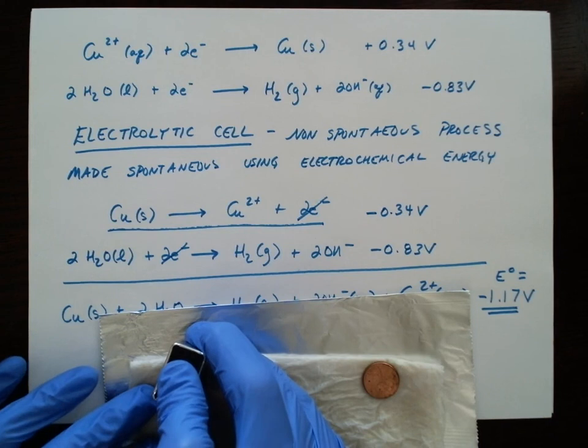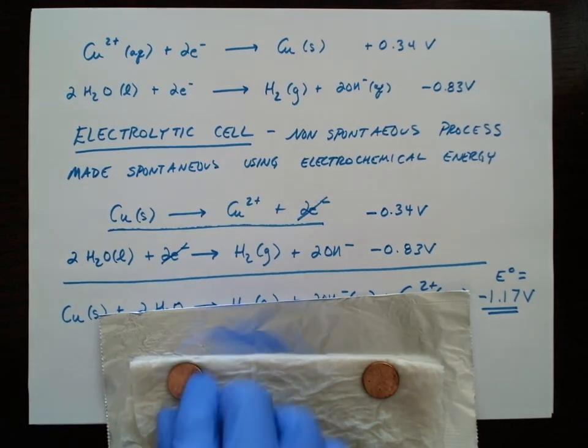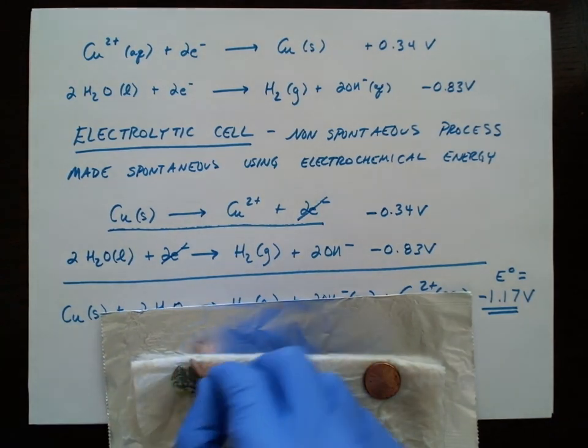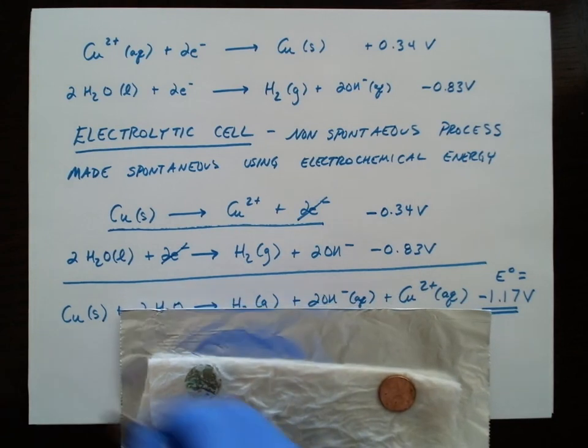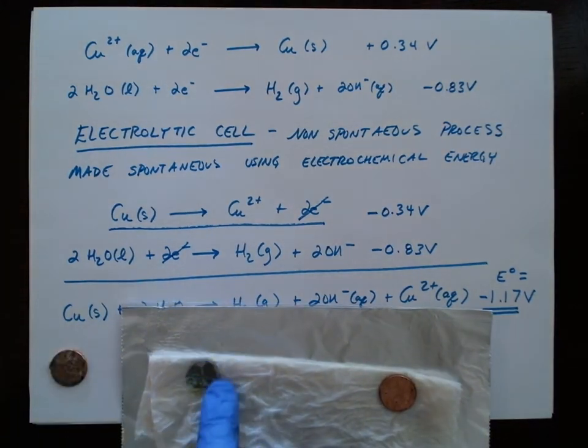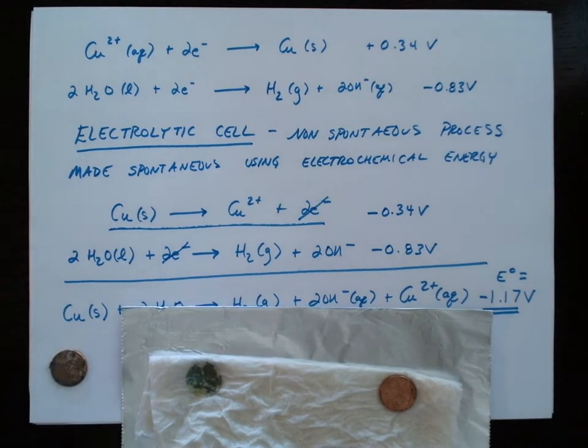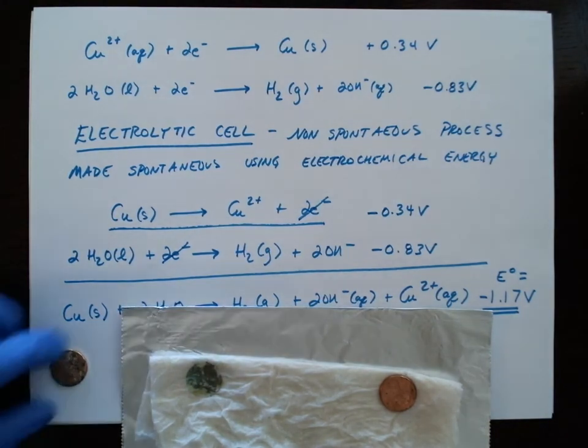Hope you can hear that. Let's see. Oh yeah, look at that. We definitely generated some copper 2 ions, sort of that blue-colored stuff that we see, that green-blue-colored stuff, definitely generated a patina.